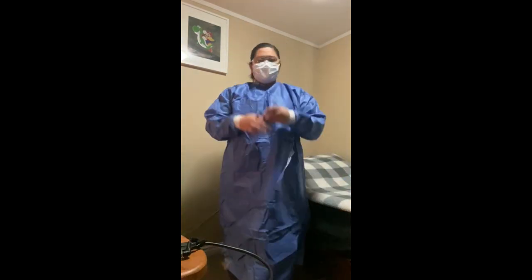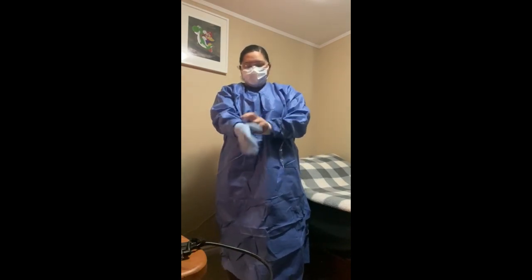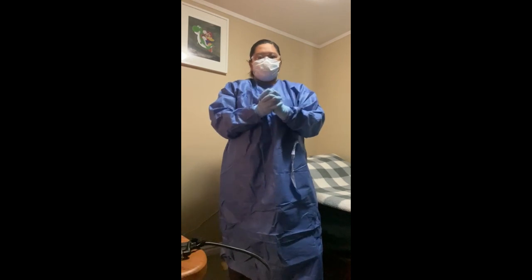And lastly, put on the gloves. Extend gloves to cover the wrist of your gown. This ensures that your hands are fully covered, protecting against contamination from contact with surfaces or patients.